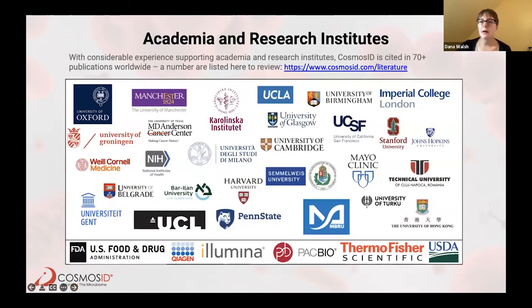So that covers my end of the talk. I think we're running a little low on time. I don't know if we have time to do a hub demo. Oh, I also wanted to mention the figures I showed you from our standard analysis, you can also produce yourself in the hub.